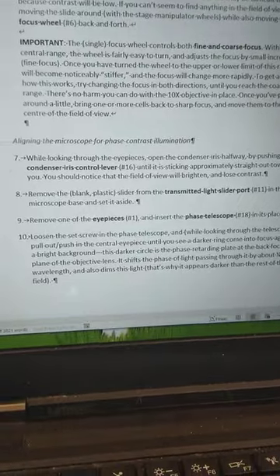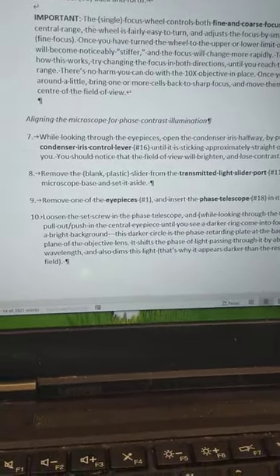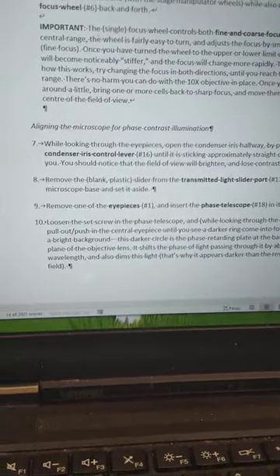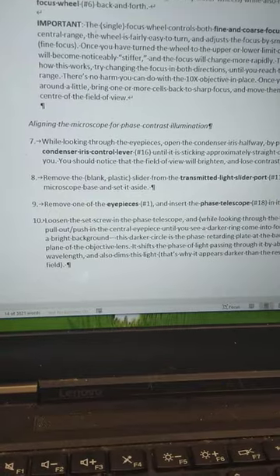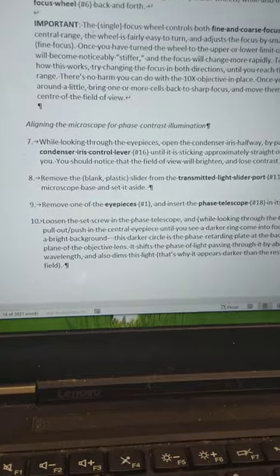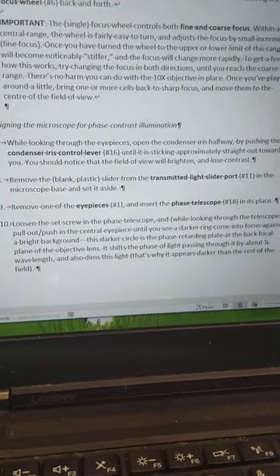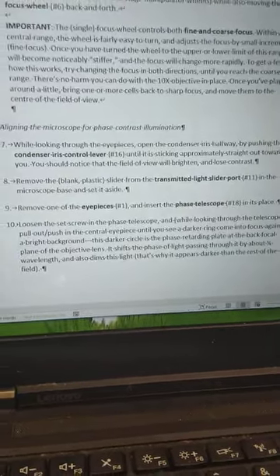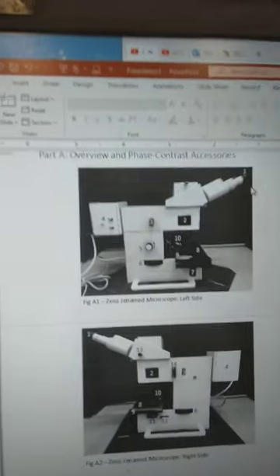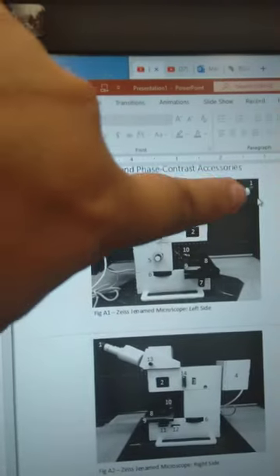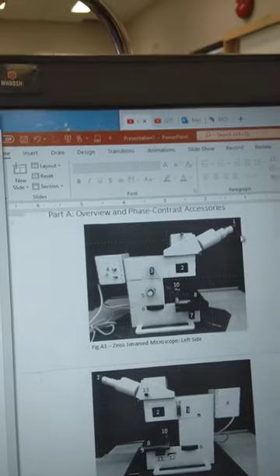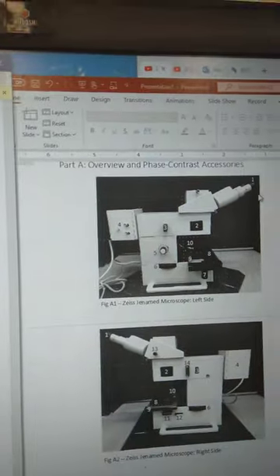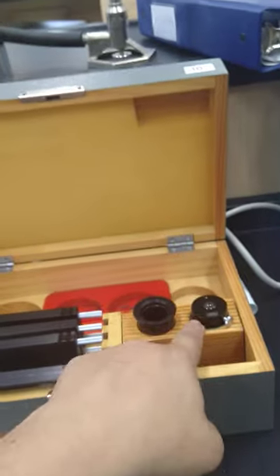Now we're going to step number nine. We have to go to the eyepiece, which is part number one, and the phase telescope, which is number 18. If we go to the graph, here is number one and number 18 will be in this box. This is the telescope.